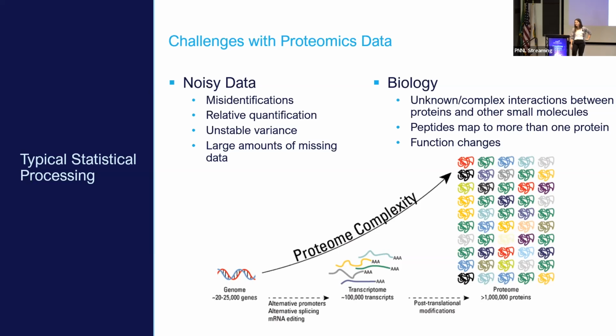Right, those aren't coded in the genome. They're coded into kinases, but you don't know which kinases are being expressed or which are active at any given time until you do the proteomics.